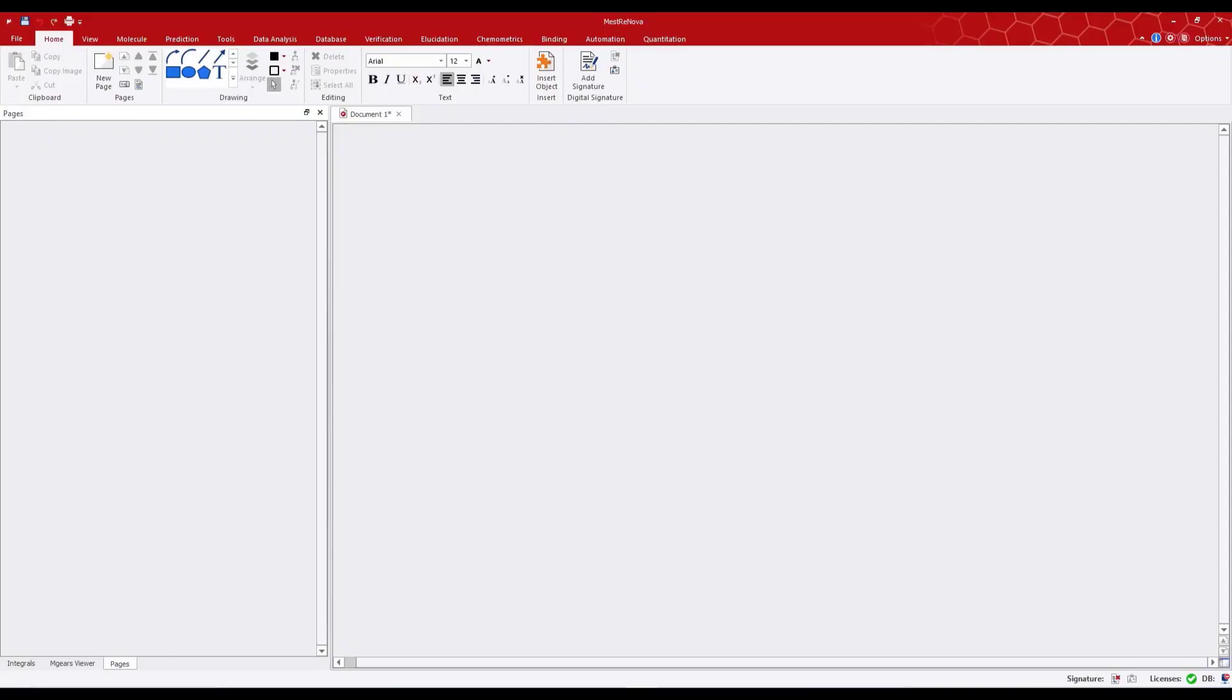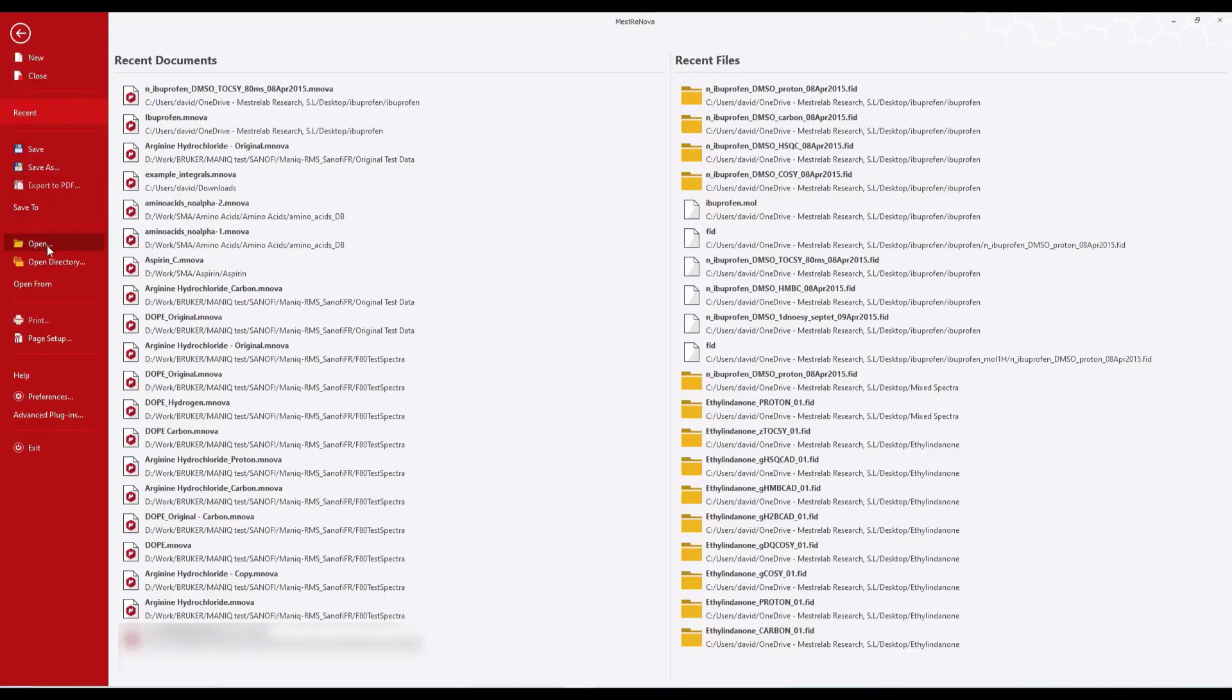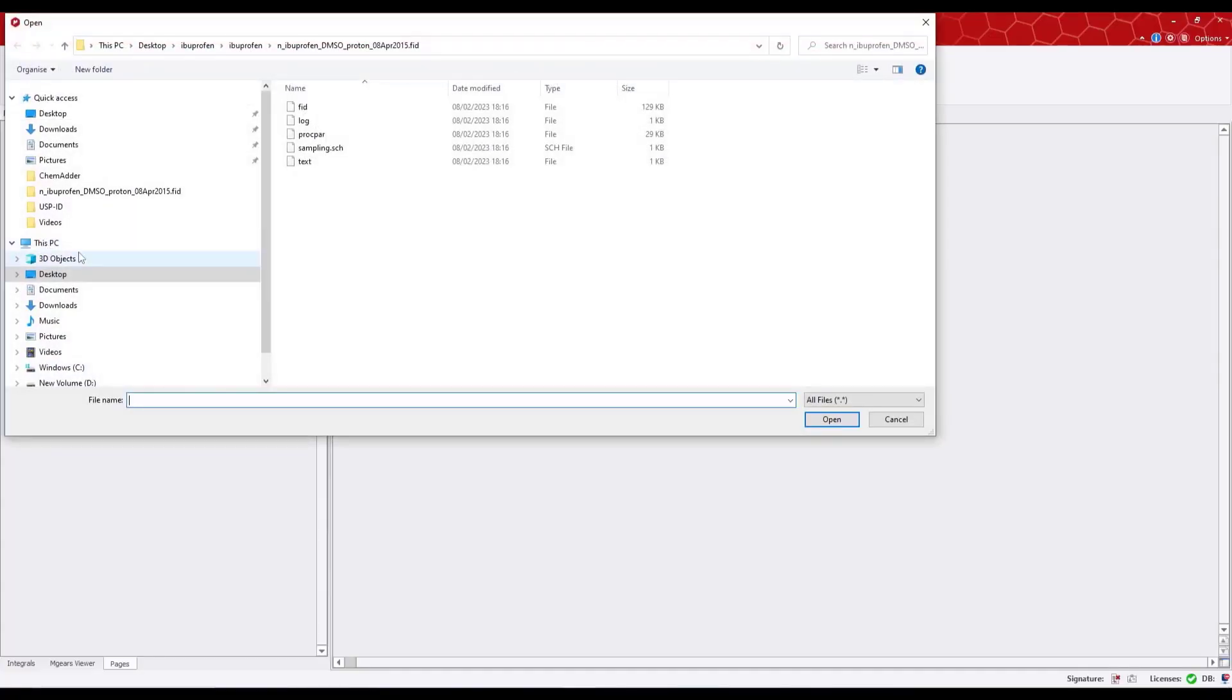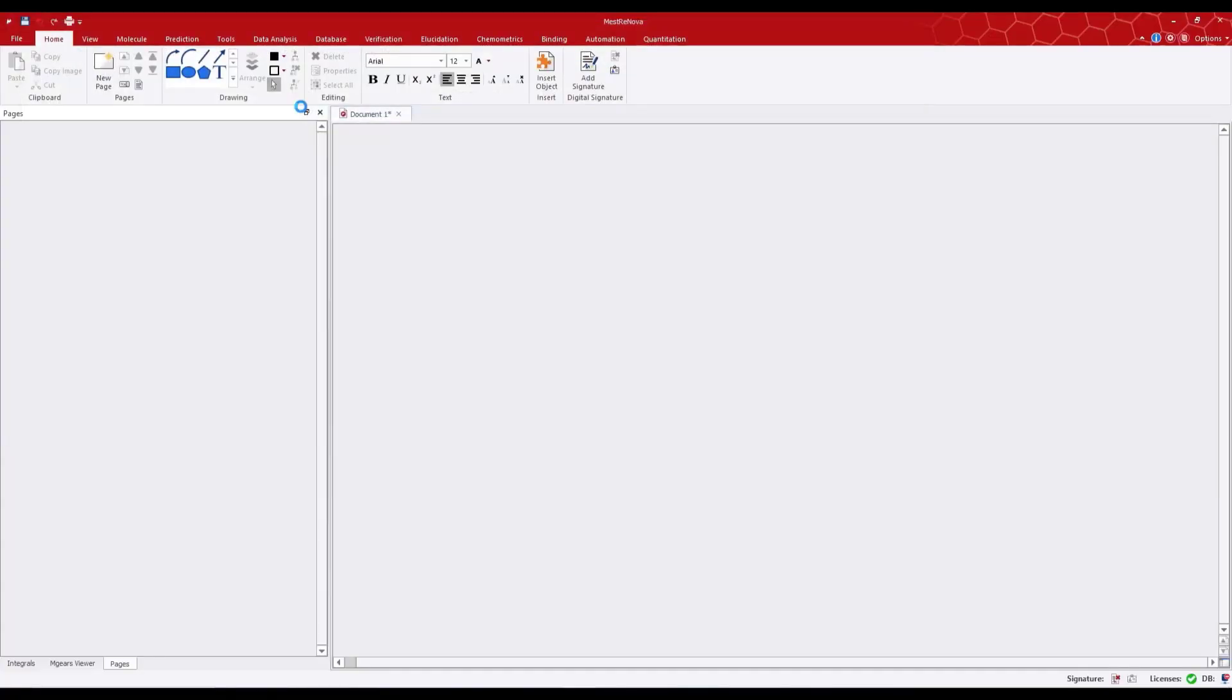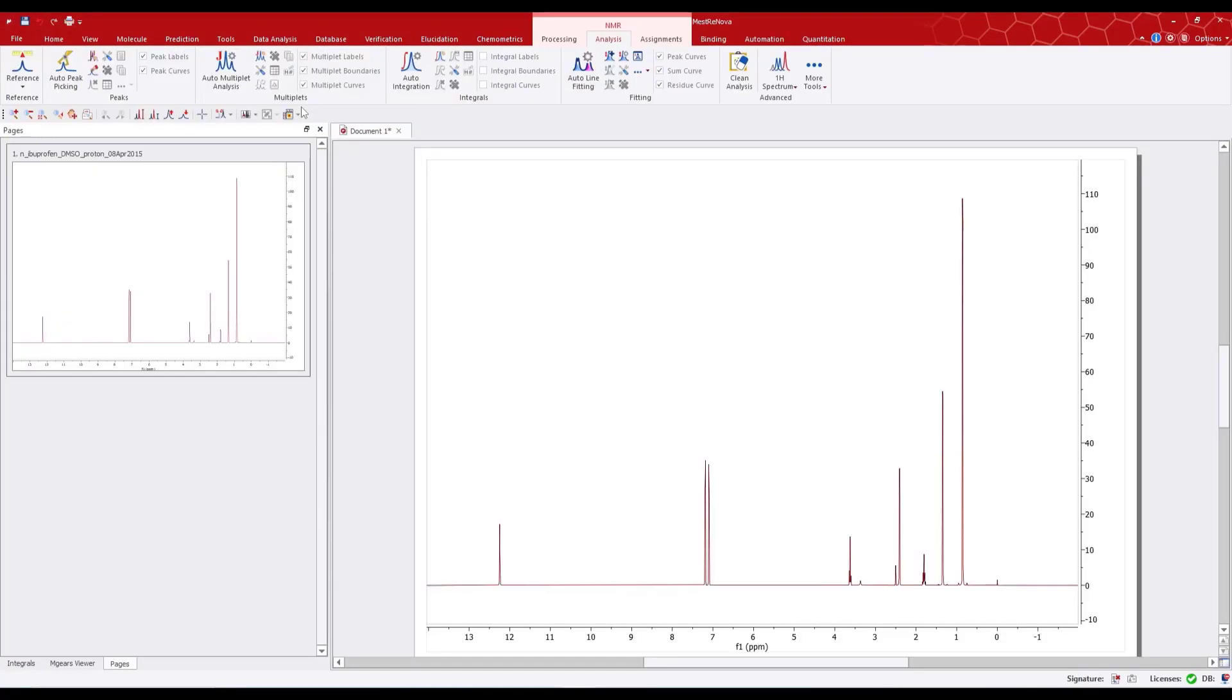There are several ways to load data into MNOVA. In the first instance, we can use the open command, navigate to the data of interest, double click, and it's loaded into MNOVA.